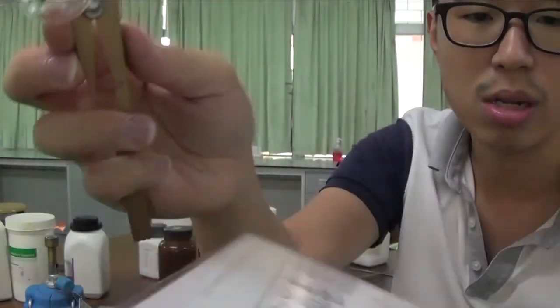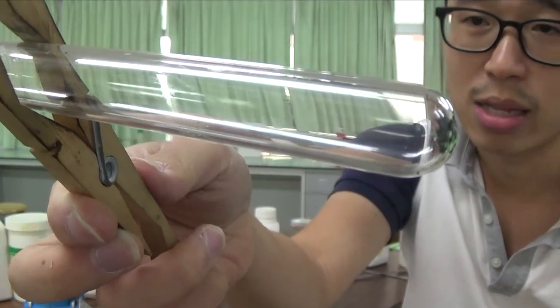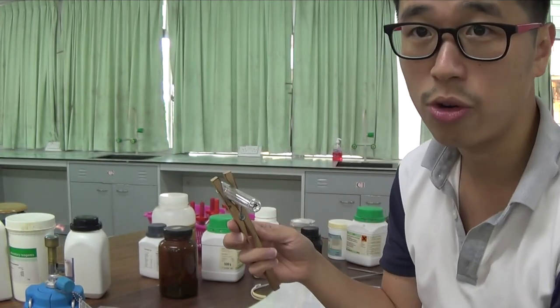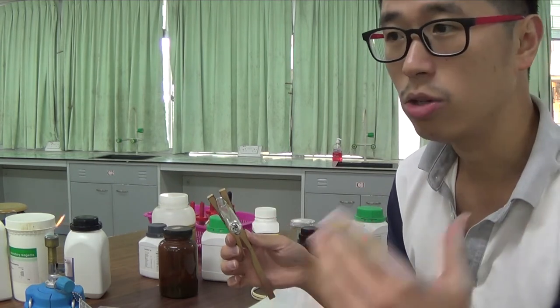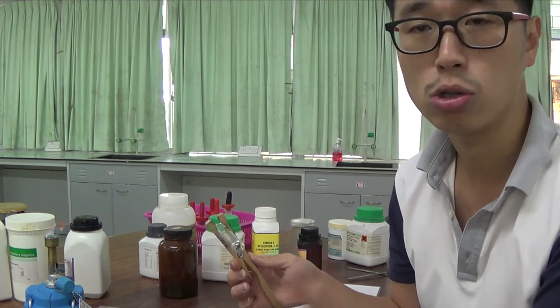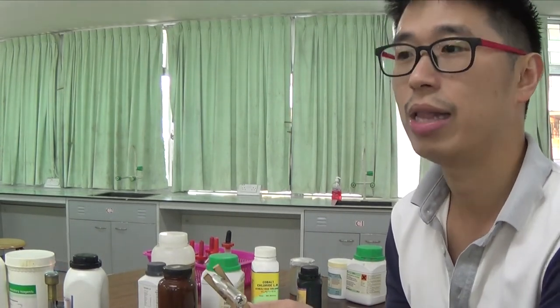It is green in color, transition metal compound, chromium. Chromium is right here, chromium, Cr. Okay, it's green colored solid. Chromium 3 plus is a cation that you'll be asked to test for in the O-level or IGCSE or even A-level exam. They like to ask you to compare. You should be able to differentiate between chromium 3 plus and also iron 2 plus when you react with sodium hydroxide by adding the sodium hydroxide first in little amount and then adding excess.